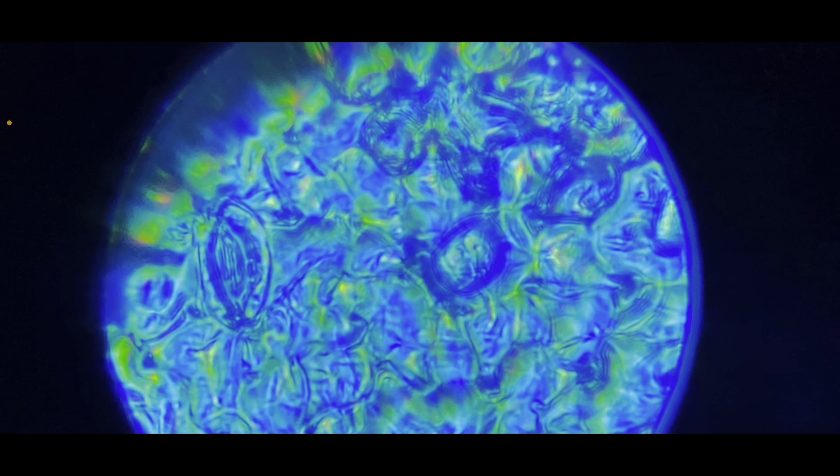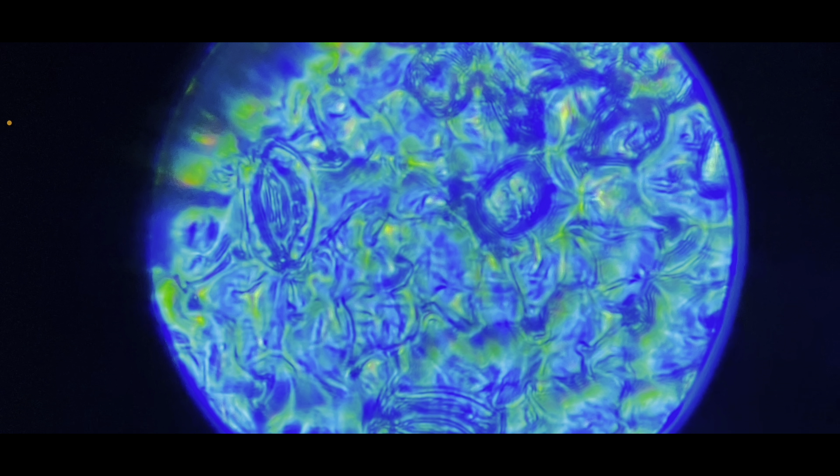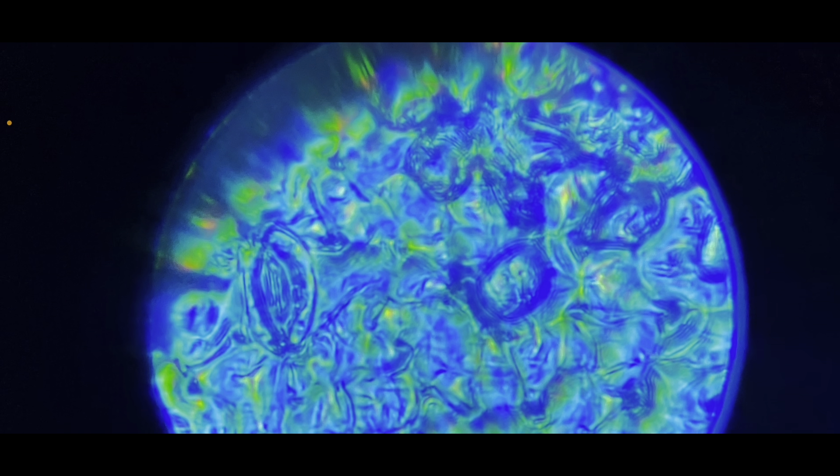It kind of makes me think of a peacock's tail — so pretty. You can see that the cell walls are super close to each other; they're adjacent, with a bunch of cells side by side. Perhaps this cell is undergoing anaphase — you can see that the chromosomes separate due to spindle fibers.